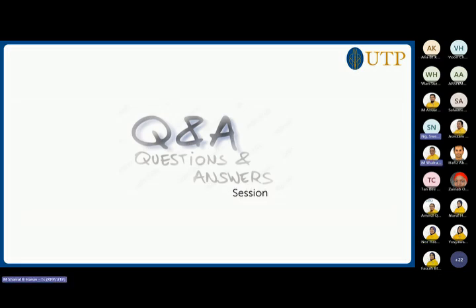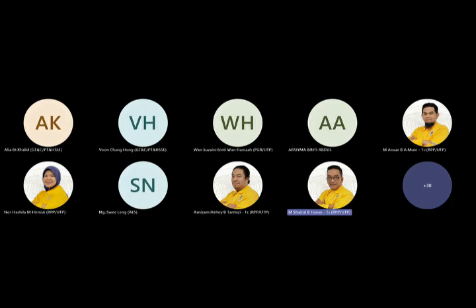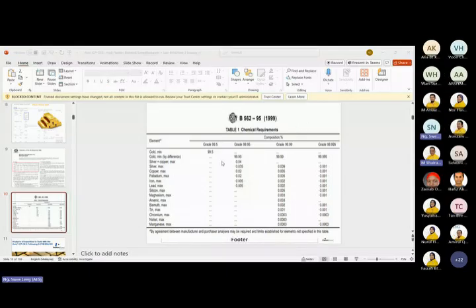For example, this is the ASTM method for gold.